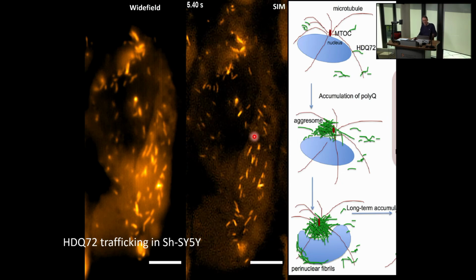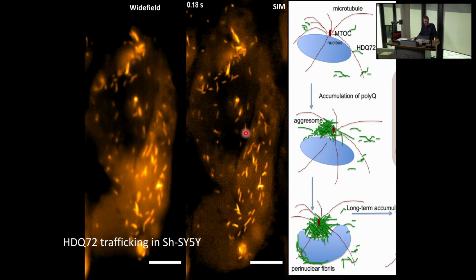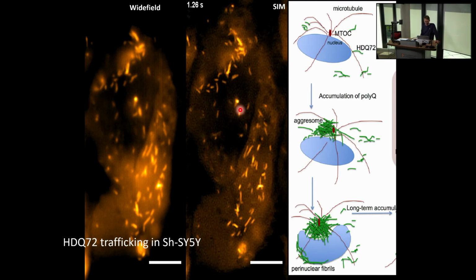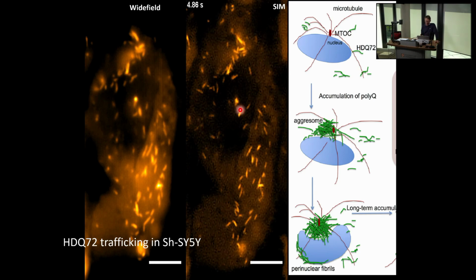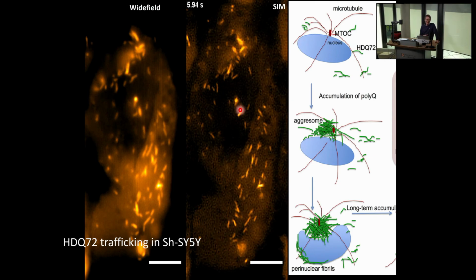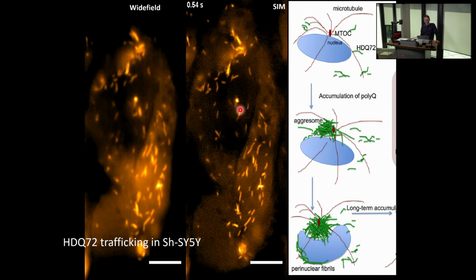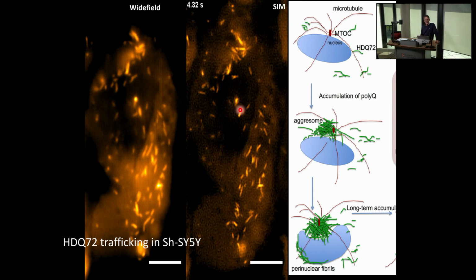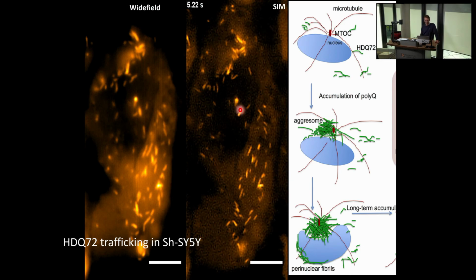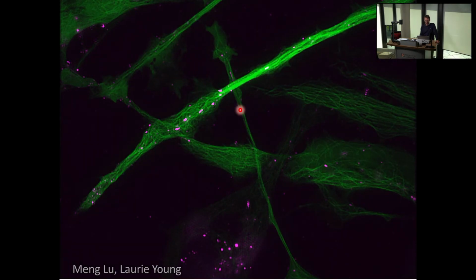These are images that were just not possible to have. It wouldn't have been possible to take images like that only about 10 years ago or so. So it really advances our way of looking at life on the molecular scale. And suddenly these cells, these tiny reactors, turn out to be highly, highly, highly dynamic entities.